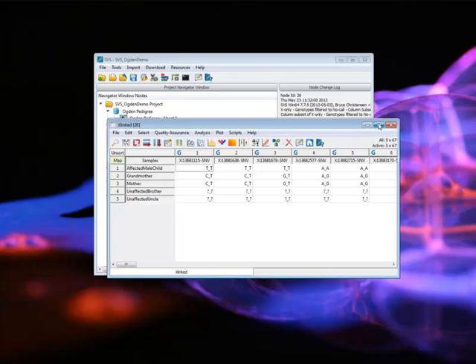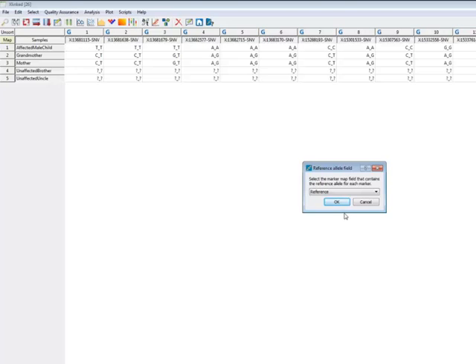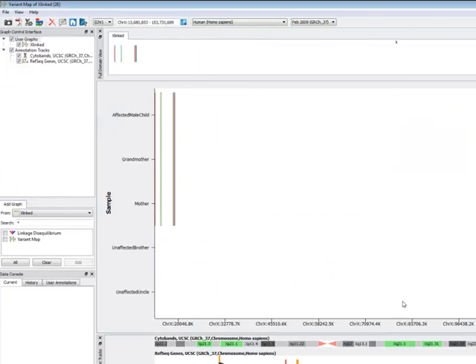And I can look at these now and see that they all follow the pattern I'm looking for, that male affected child being homozygous with the carrier females being heterozygous. Another way to look at this is to throw it in the genome browser view. And this is our old genome browser. It's going to be replaced with a new and improved interface soon.